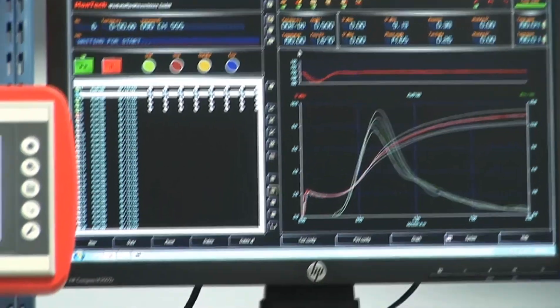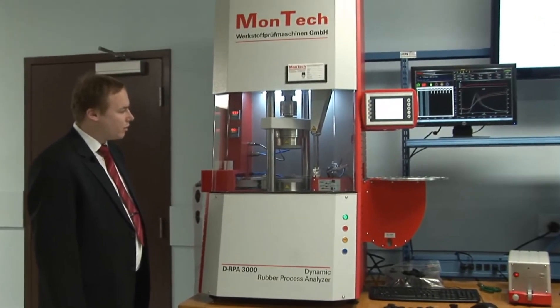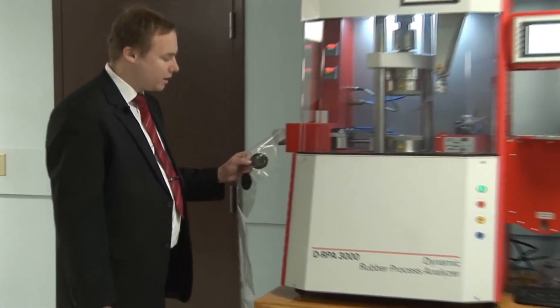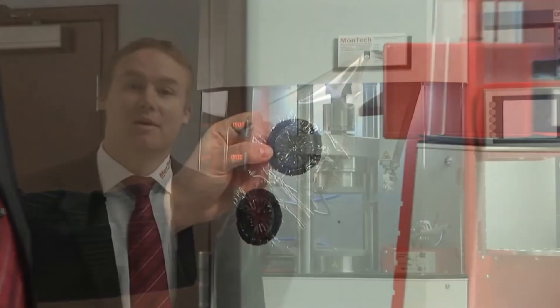Now we see the second test finished. The sample is automatically removed from the die and here we can see the tested samples fed out of the machine. Thank you very much for letting me demonstrate the best price-performance RPA on the market.